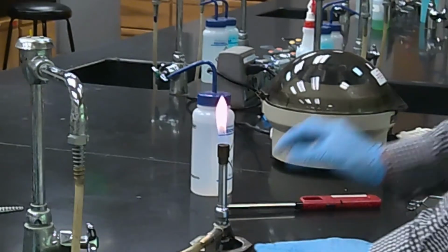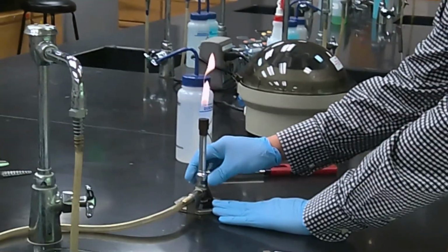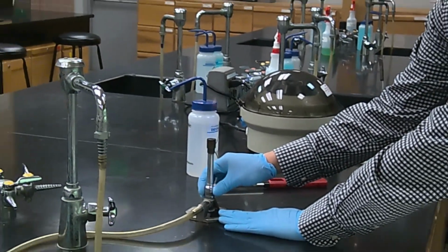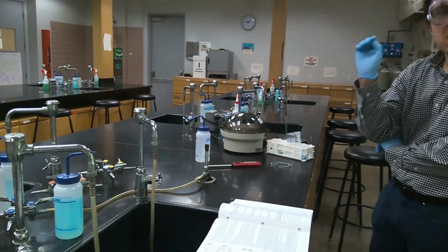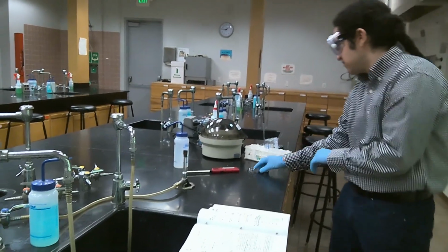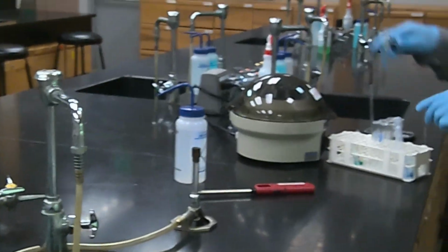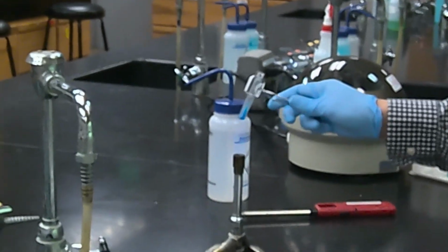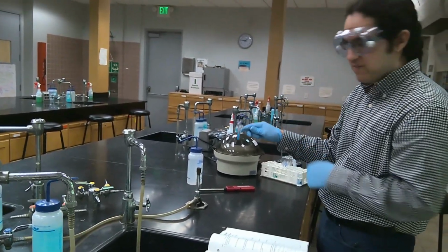And in order to generate a weak flame, I'm going to increase my oxygen intake until I have a pale blue flame with a lightly defined inner blue cone. We do not need a well-defined inner blue cone for this drying step because we want to minimize spatter. Next, I'm going to place my test tube in a test tube holder, and then I'm going to gently bring my test tube into the flame, keeping it pointed away from me for safety.